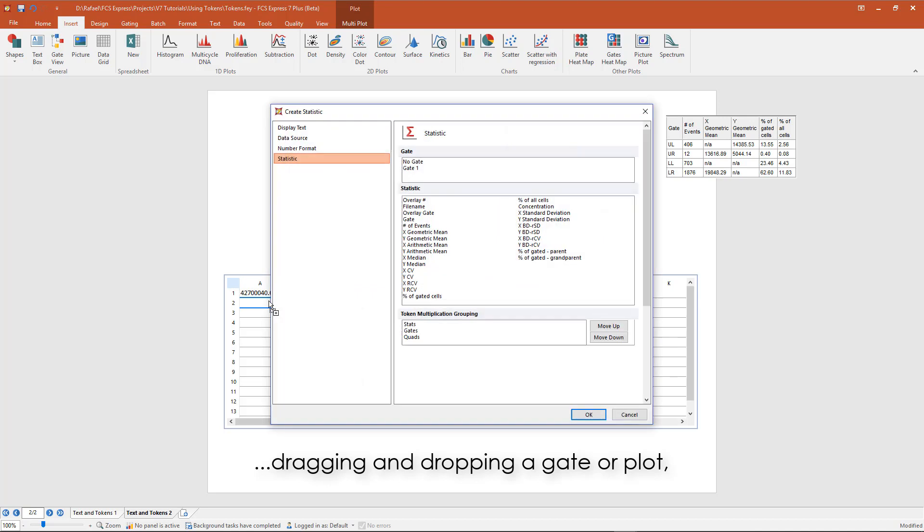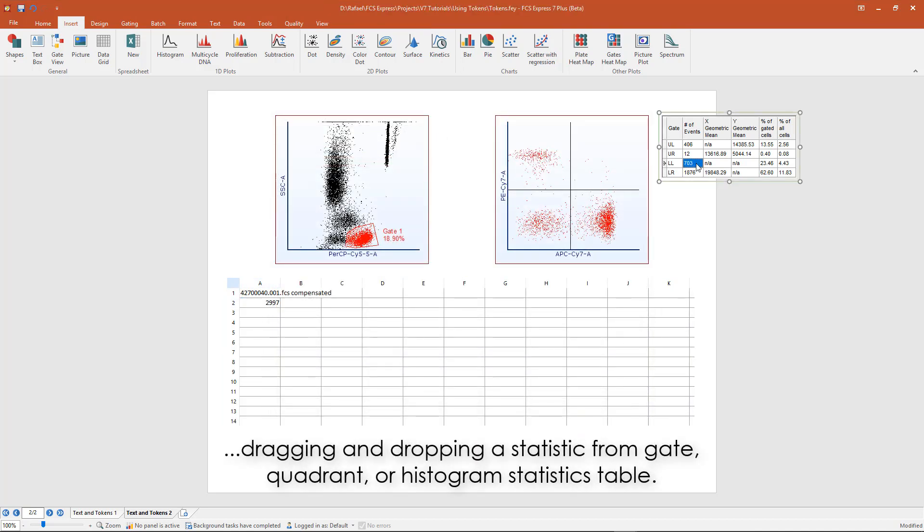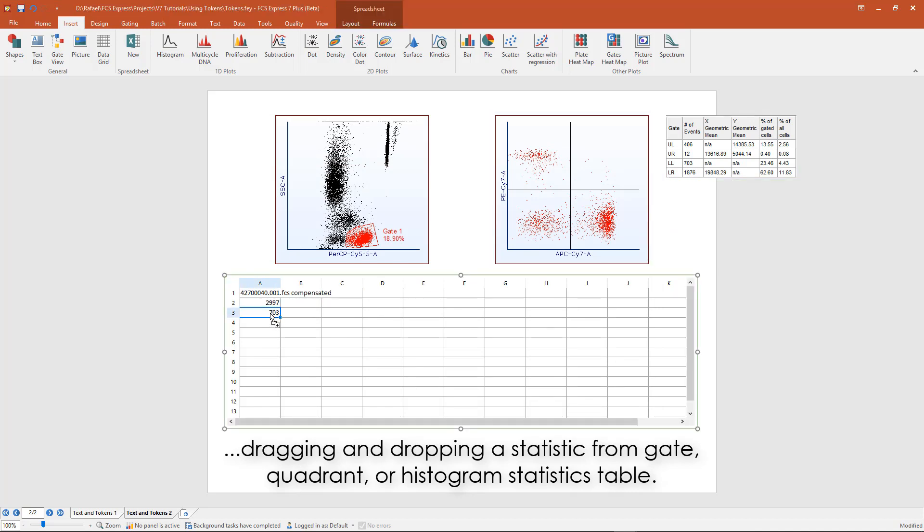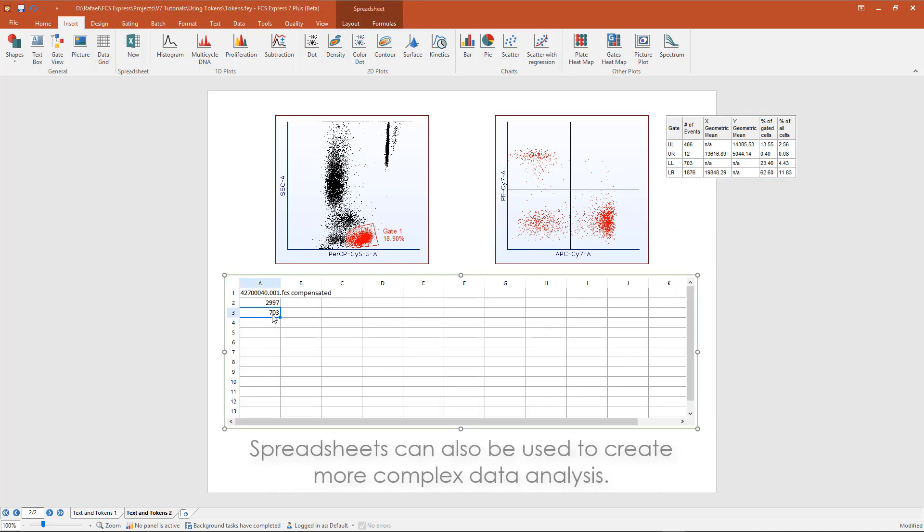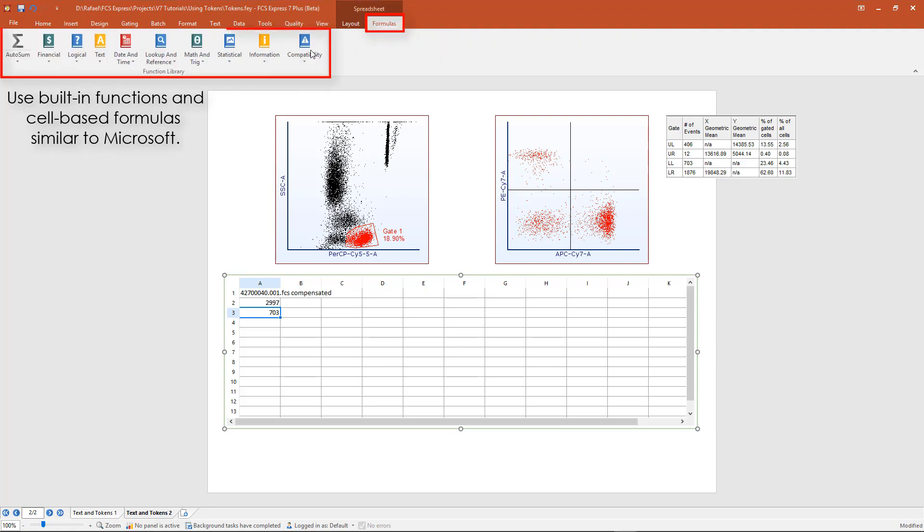Tokens can also be inserted by dragging and dropping a statistic from a stat box into a spreadsheet cell. In addition, spreadsheets can be used for more complex data analysis, using custom formulas and functions similar to Microsoft Excel.